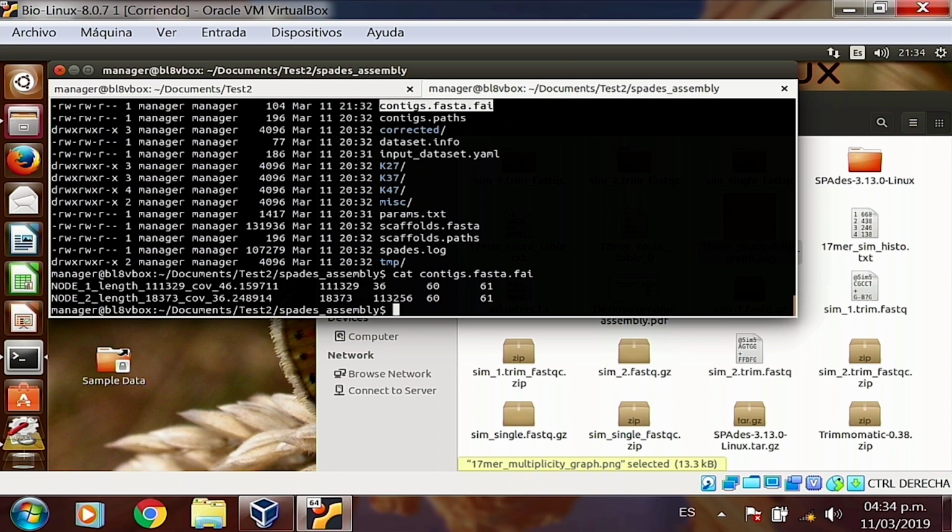So have you already been able to execute the samtools faidx command? Did you all create the contigs.fasta.fai? And you were all able to see it? Yes. All right?